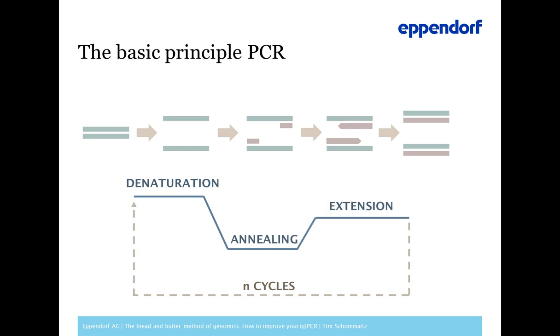So I think you have seen that 100 times, as well as the basic principle of qPCR, where you are introducing some sort of reporter. It can be a specific reporter like a beacon or a probe, or something more unspecific like an intercalating dye. In principle, it follows the same process as a regular PCR, just at the end, or during the process, you're measuring a fluorescence, and this will reflect the amount of your input material, making it possible to do a quantitative analysis.